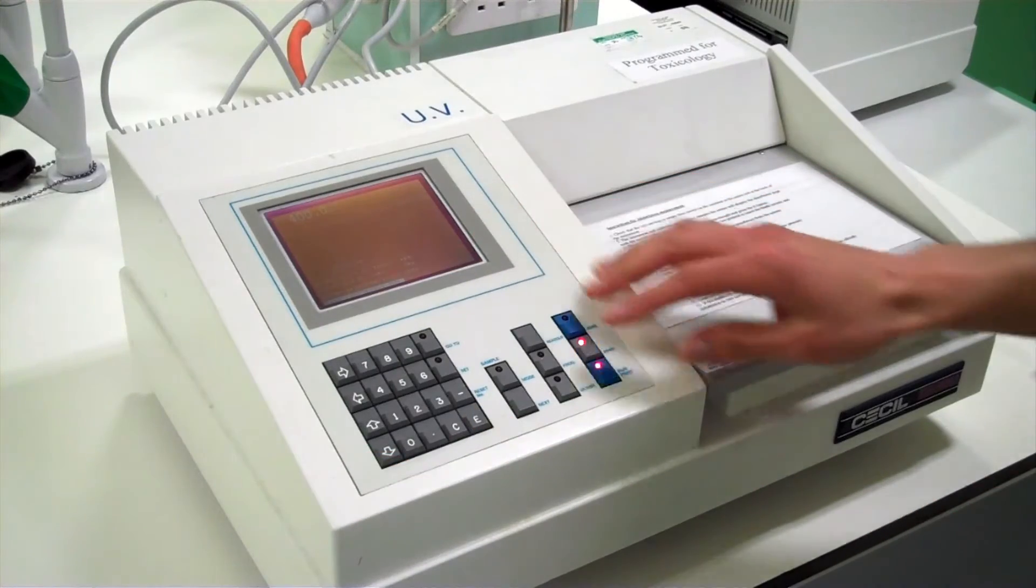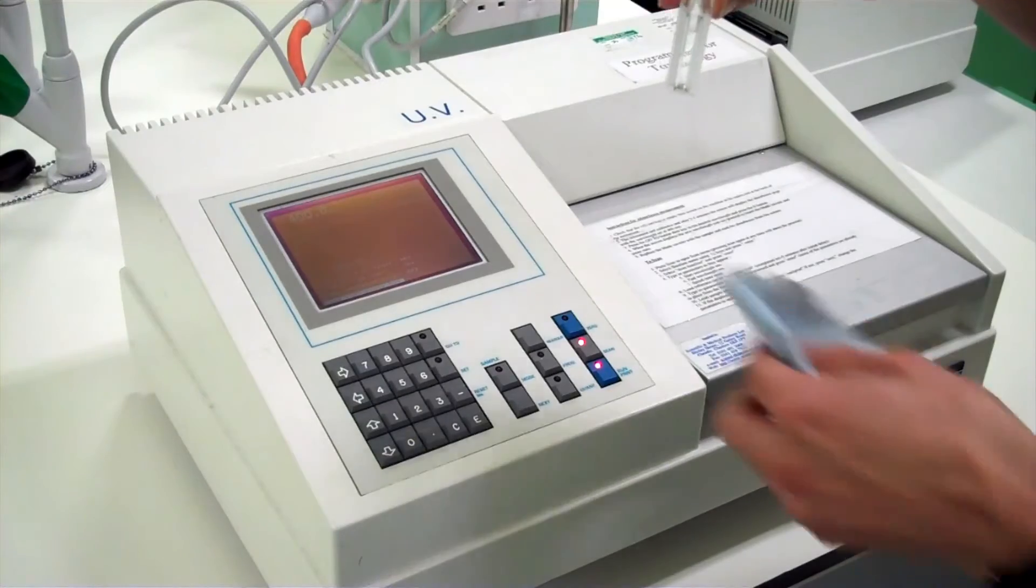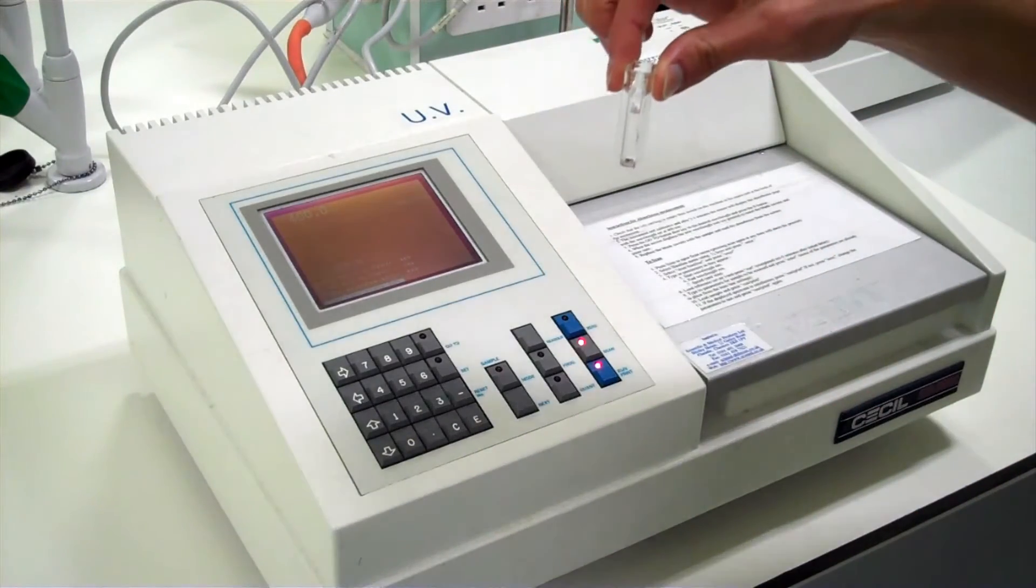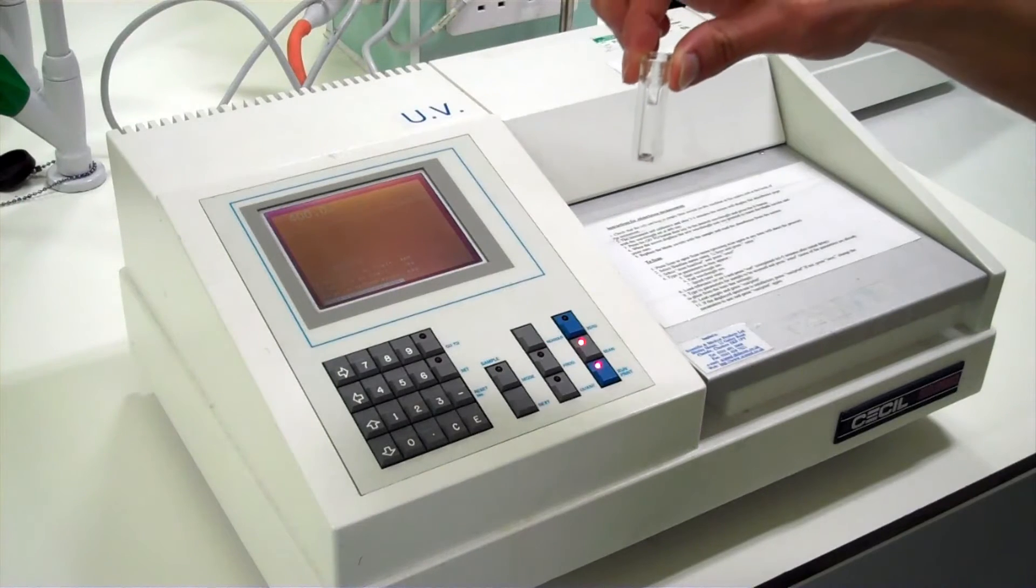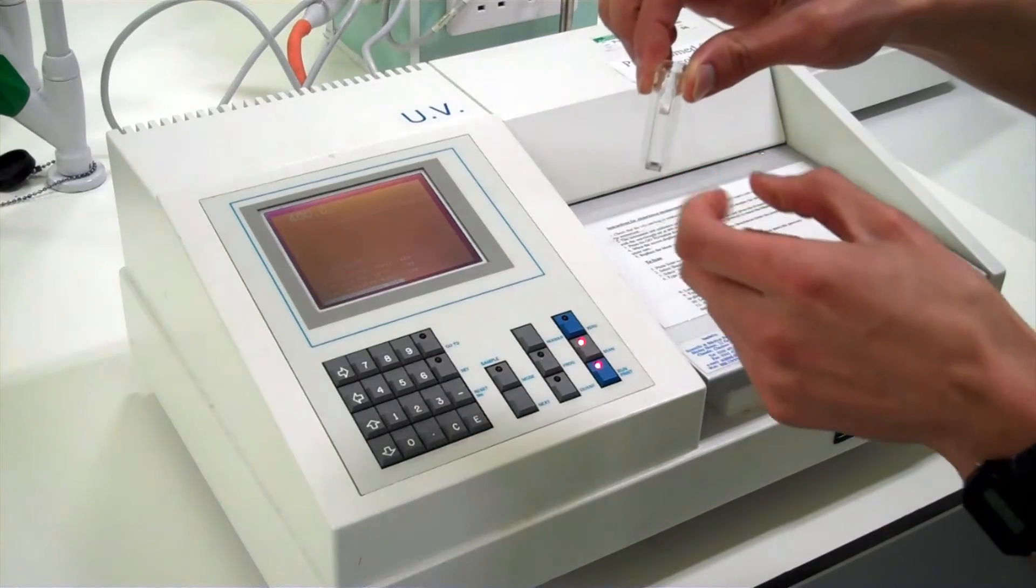We can then load the blank. But before we do make sure there are no fingerprints on the outside of the cuvette which may reflect or absorb light. Because of this it is good practice to hold it from the top and not the sides. Gently tap or flick the cuvette to get rid of any air bubbles which may scatter light.